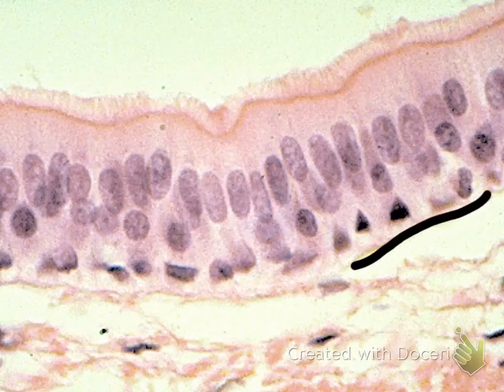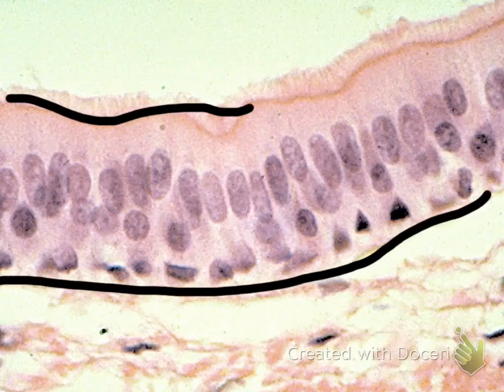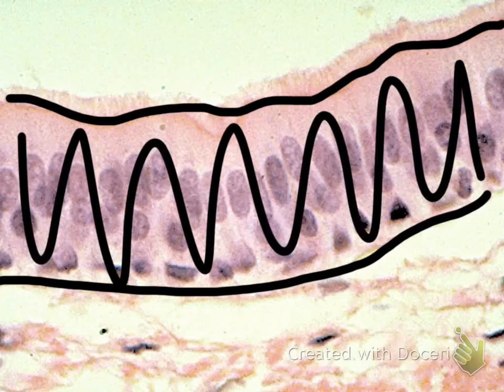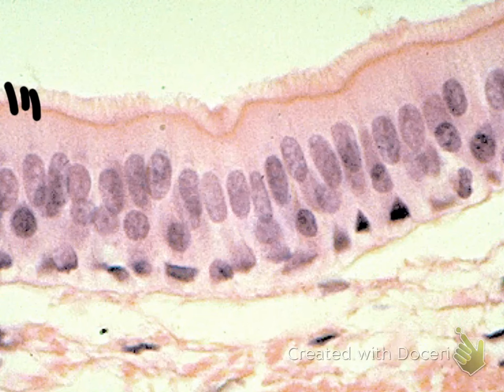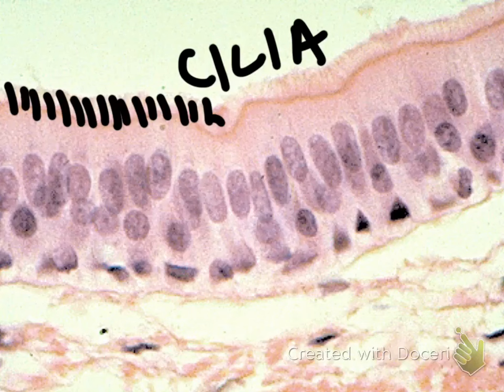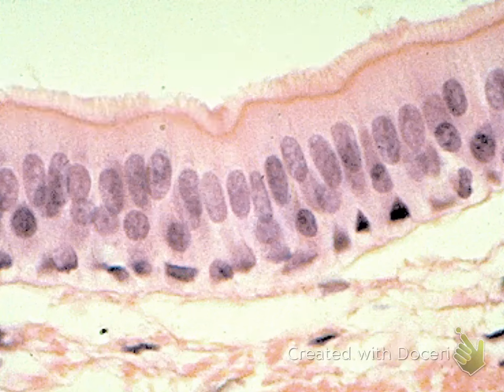Here's your basement membrane and here is your apical surface, which means this is your epithelial tissue and this is your connective tissue underneath. Near the apical surface, notice the hair-like structures — these are your cilia. As soon as you see cilia, you should think pseudostratified columnar epithelium. It doesn't mean that other cell types don't have cilia; it's just that the only ones I'm going to show you will be pseudostratified columnar epithelium.